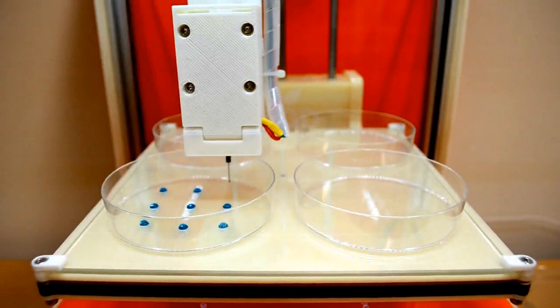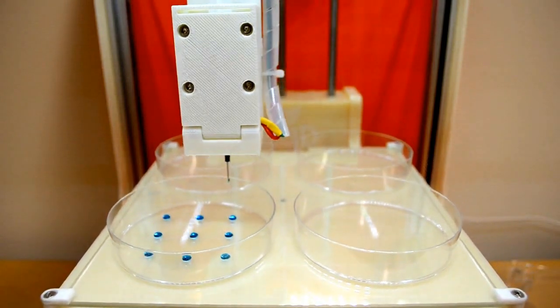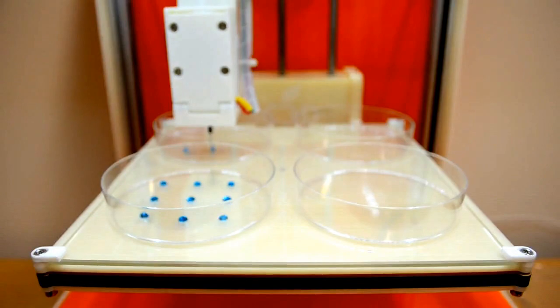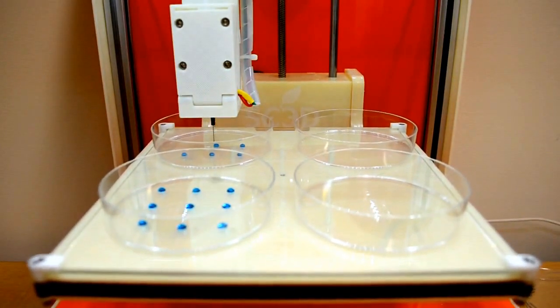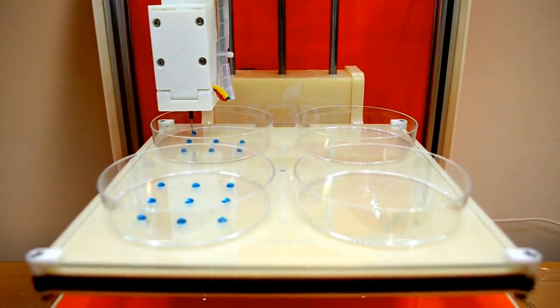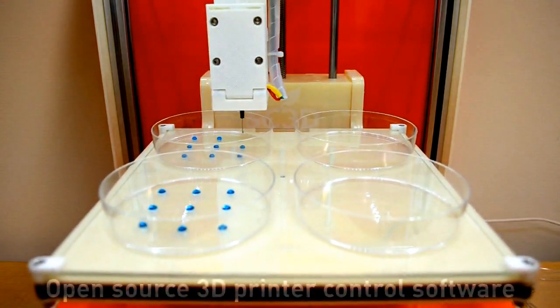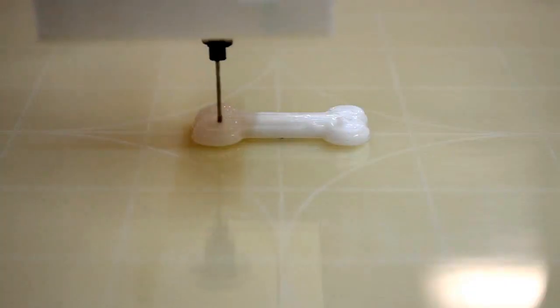This would replicate how the industry uses commercial 3D bioprinters to create high-throughput assays for screening potential drug candidates. REBEL can also be used to print liquid solutions in conjunction with an open-source 3D printer-controlled software.